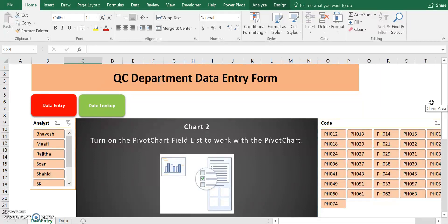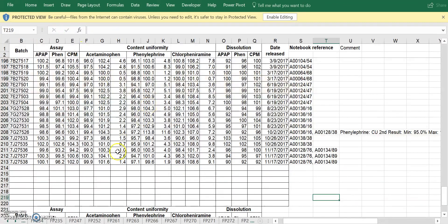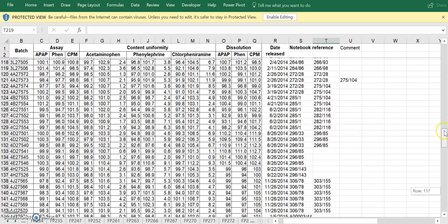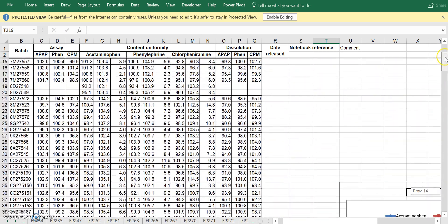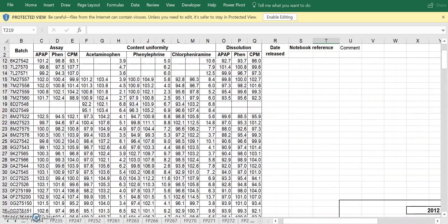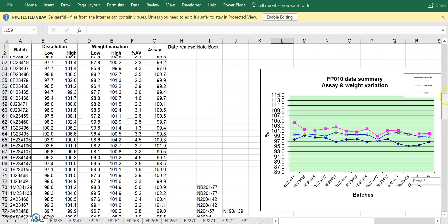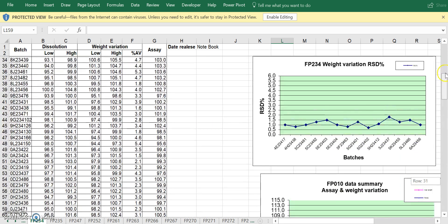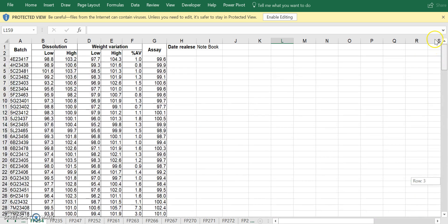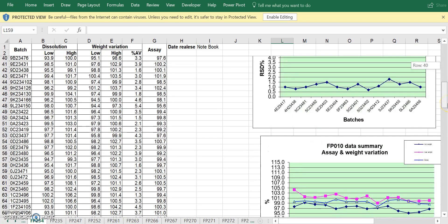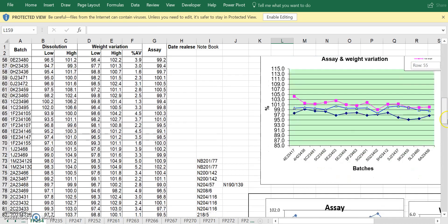Now, I'd like to show you a glimpse of how our department used to manage our data. So this is a spreadsheet that we use to keep all our data. As you can see, we have multiple worksheets, a lot of them. We have one for each product code. So let's just see one. As you can see, the information is on the left. The table is on the left. We have the batch number, the dissolution, the weight variation, and the percent purity, which is assay. And then the date release and notebook information. All these are manually entered in the system.